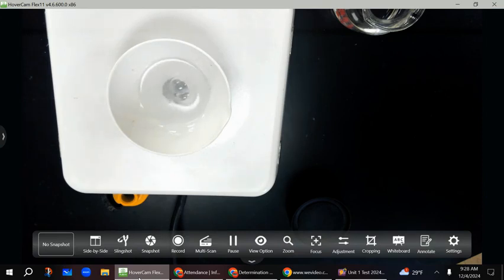Not off, but down a little bit. You want the things to stay in the container, the salt and things that we are creating. You are now creating zinc chloride. And that is what we are going to collect at the end to see if we can determine its formula.